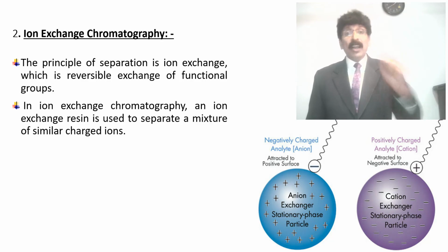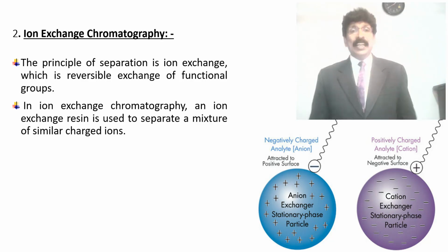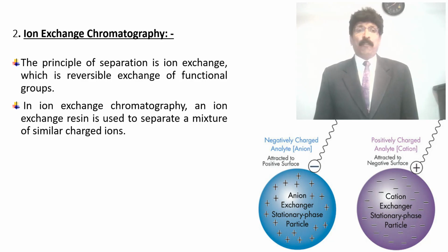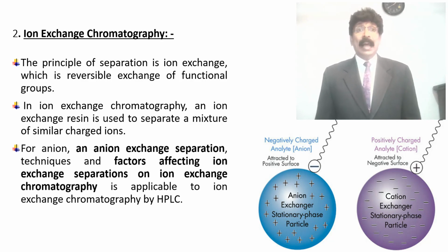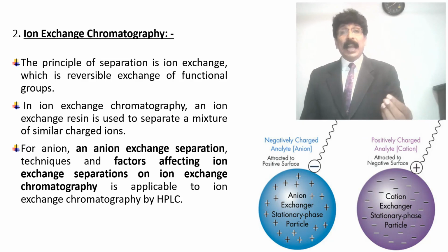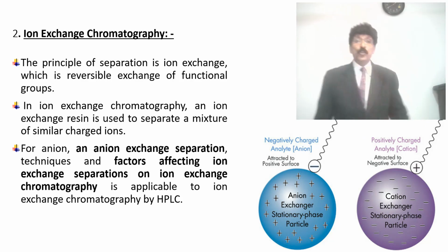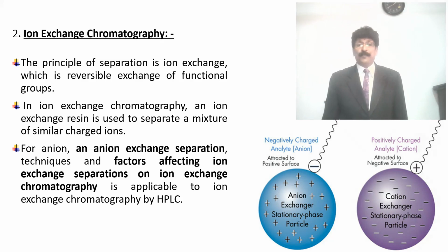In ion exchange chromatography, an ion exchange resin is used to separate a mixture of similarly charged ions. For an anion exchange separation, the techniques and factors affecting ion exchange separation in ion exchange chromatography are applicable to ion exchange chromatography of HPLC.